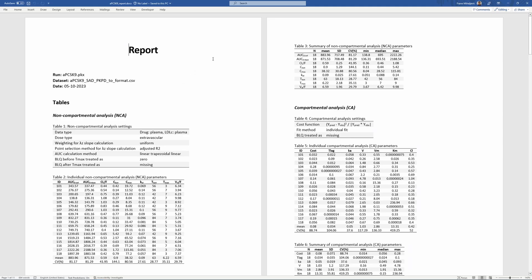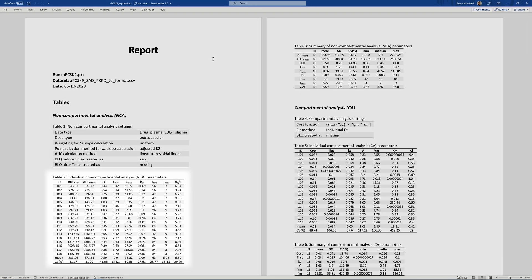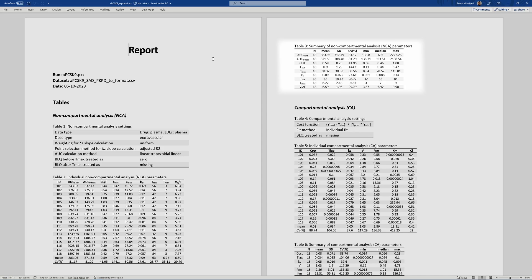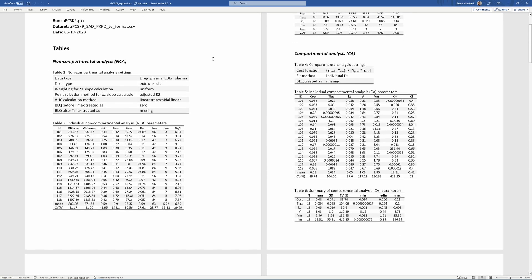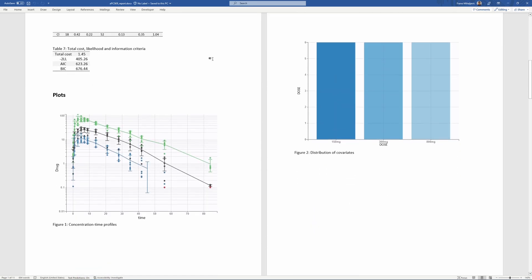If a project contains NCA results, the report will contain tables with NCA settings, individual NCA metrics, and summary, and a summary table of metrics, as well as plots generated and customized in the interface.